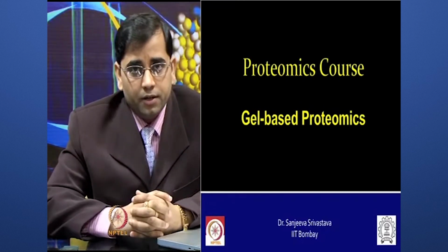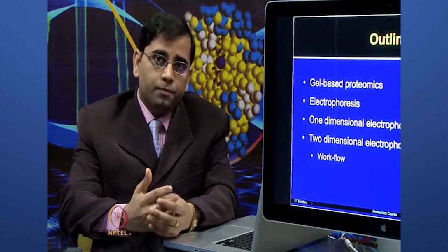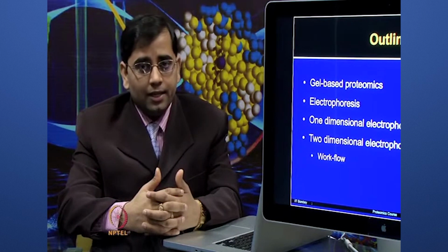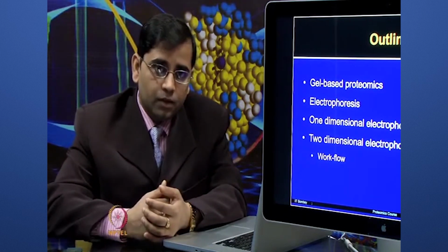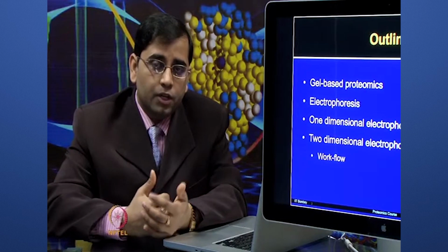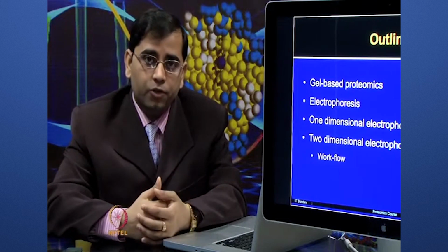In today's lecture of gel-based proteomics, I will give you the concepts of different electrophoresis types for one-dimension electrophoresis and two-dimension electrophoresis. During this description of two-dimensional electrophoresis, I will give you the workflow of several steps involved.